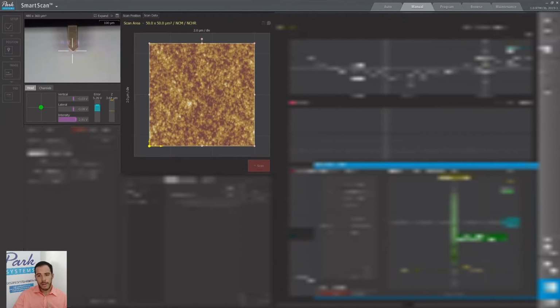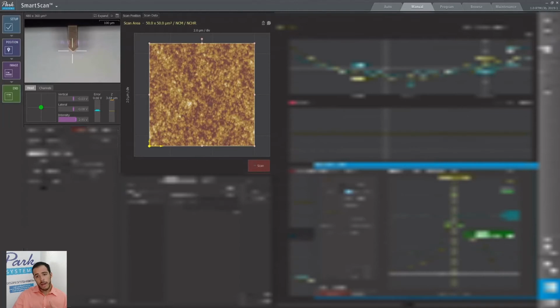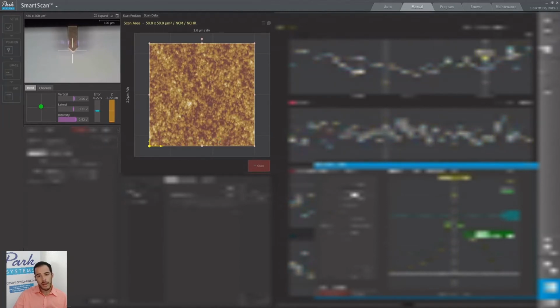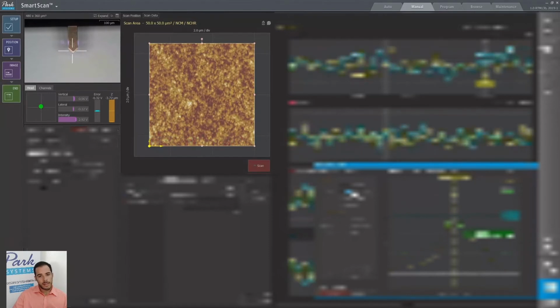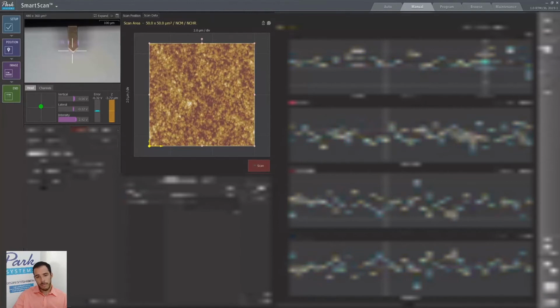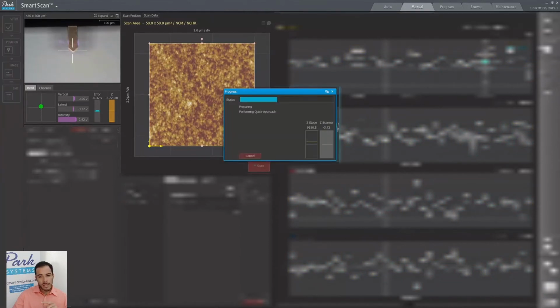You can see right now that this is not a new cantilever, but it's going to work for our purposes right now. I'm going to select 10 nanometers amplitude, and once we're done, I can just close this window and go directly to my scan window. And there I can just adjust the settings. I'm going to be using the same settings that I was using before in the pre-scan image, although I first have to approach. Okay, now we're approaching.